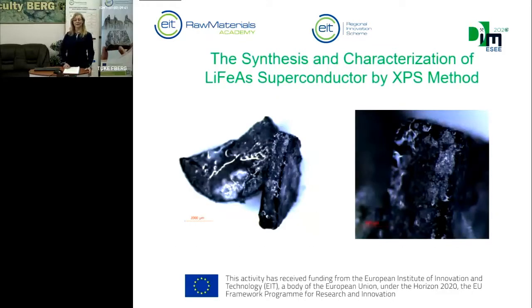Very nice was the study of a superconductor by XPS method. At our institute, we prepared the lithium-iron arsenic superconductor with the cooperation of the Slovak Academy of Science. A superconductor is a conductor without resistance or without energy losses. This material is very interesting and very nice, and we characterized this material by XPS device.